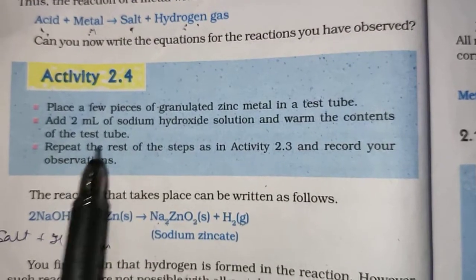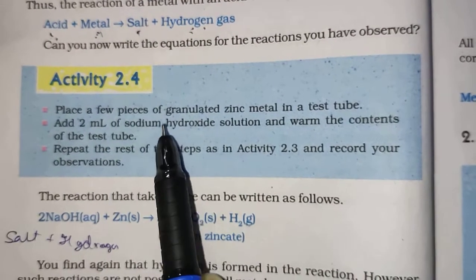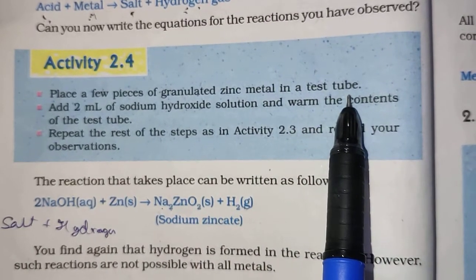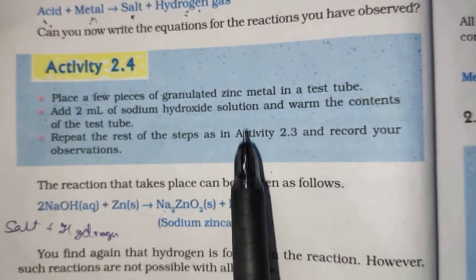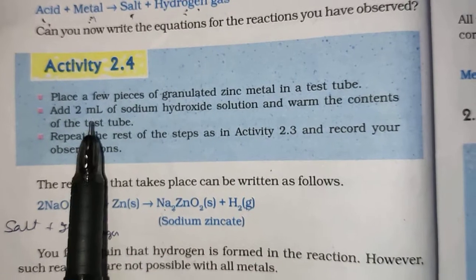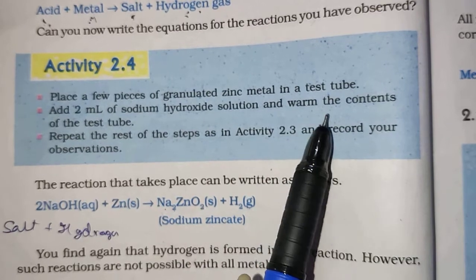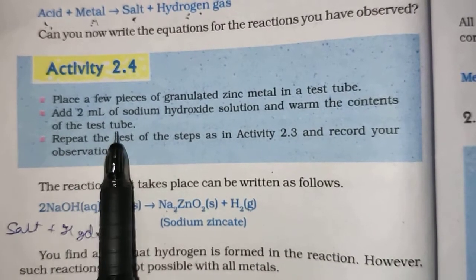Next, place a few pieces of granulated zinc metal in a test tube. Granulated zinc metal means granules. Add 2 ml of sodium hydroxide solution and warm the contents of the test tube.